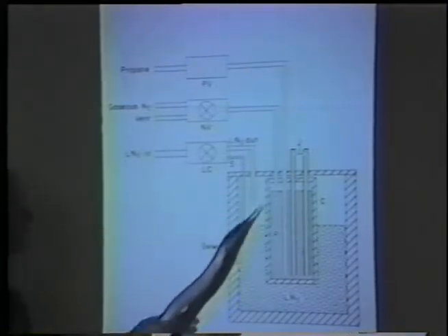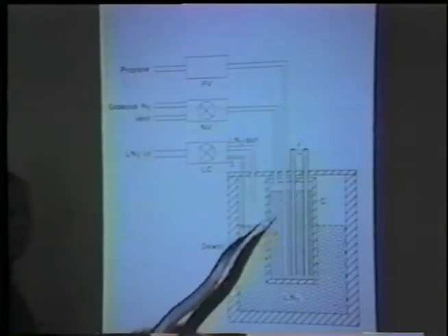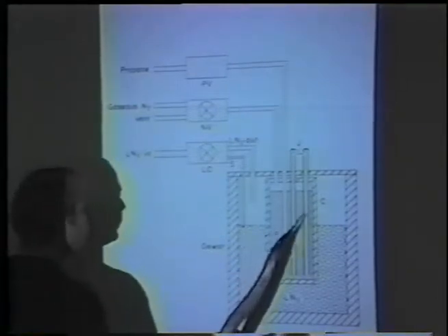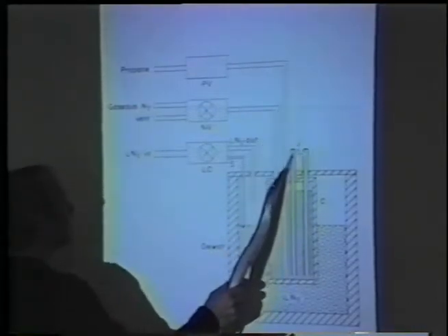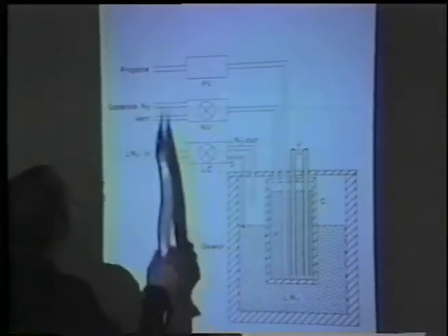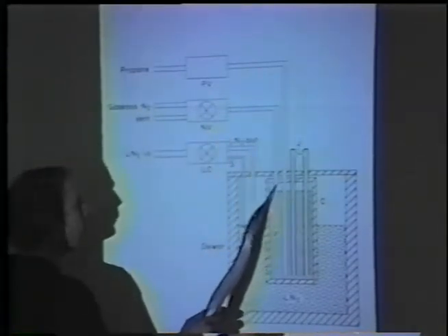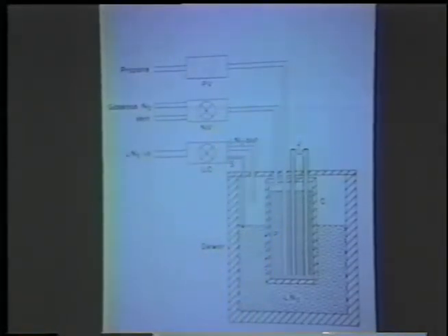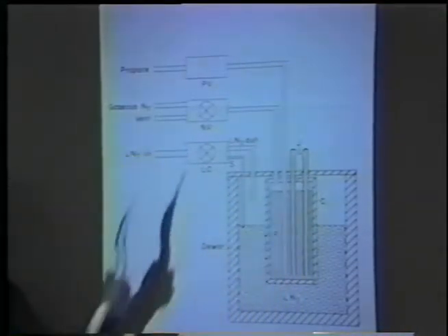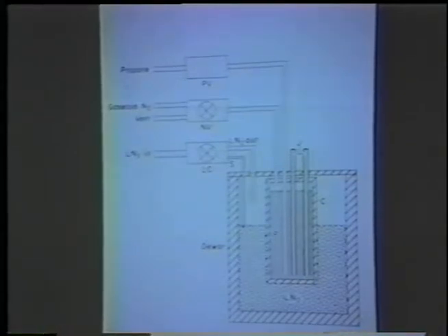And in our current device, I should say, we have cartridge heaters in the cylinder wall to keep the cryogen from ever freezing. In the earlier models, that was a problem. You had to work fast. Otherwise, you'd get your sample over there, press the button, and nothing happened because the cryogen was frozen. This never happens in the new machine. At any rate, once the sample is ready, you put it between the jets. There are just two tubes projecting from this cylinder, open at the bottom, and you pressurize the cylinder to 10 atmospheres with gaseous nitrogen. This drives the propane or whatever cryogen you're using out of the jets and sprays it onto the sample. Very simple system.